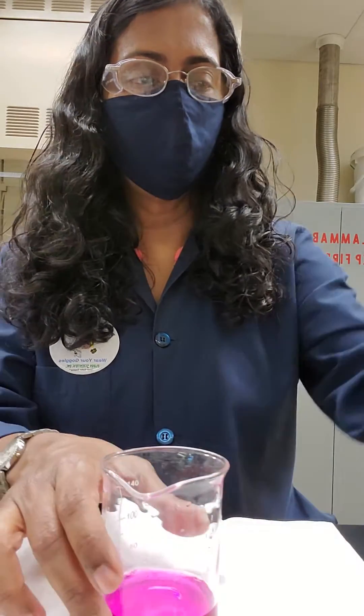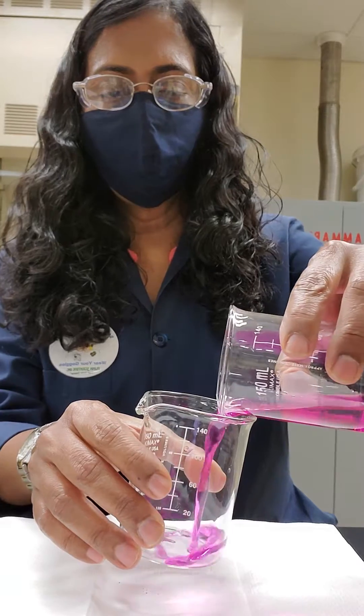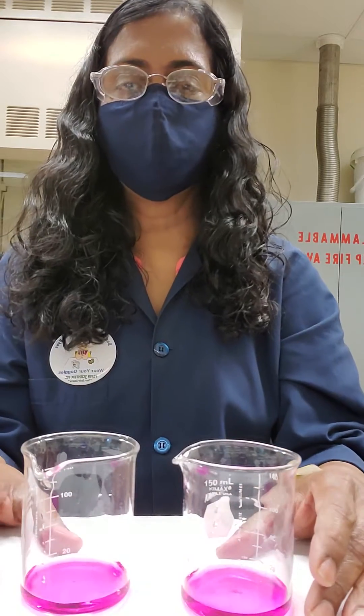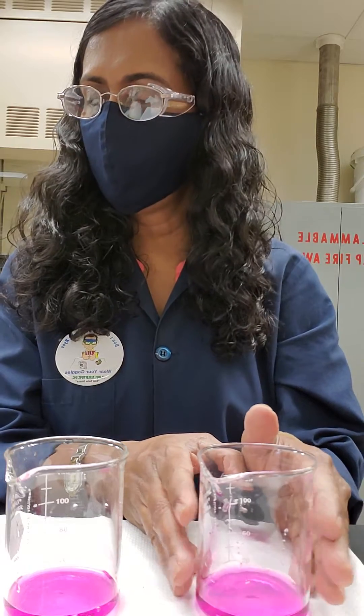We are supposed to split that into two containers. I grabbed another small beaker and I'm going to pour half of that into it. One will be our reference or the control experiment, and I'm going to work with the other solution here.